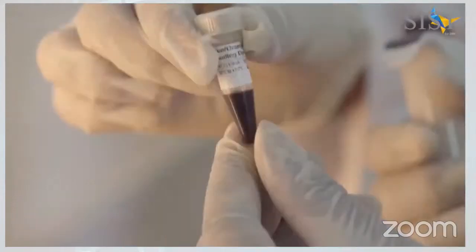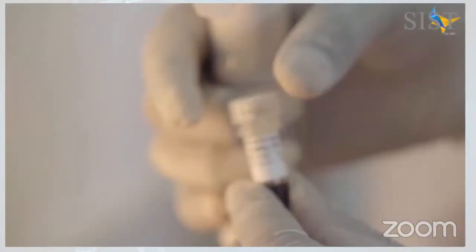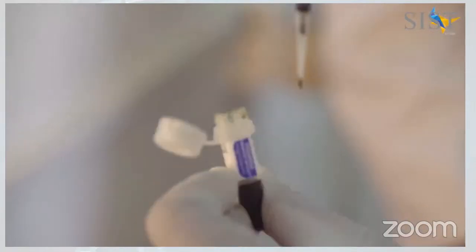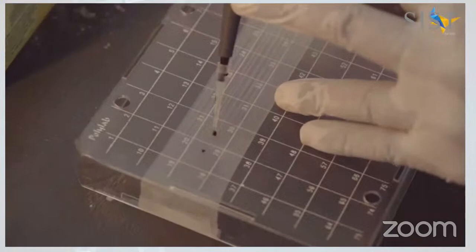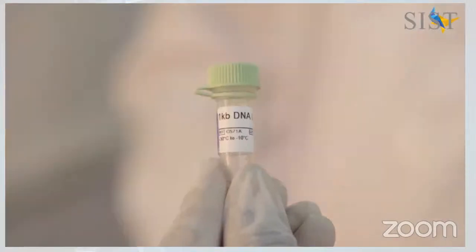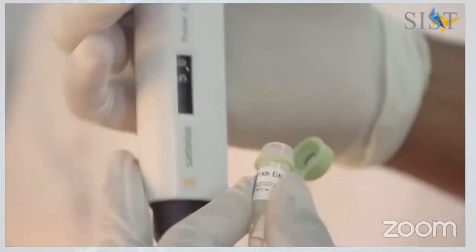buffer solution. When loading, you will need to add your loading dye before you add your sample. So here you take the required volume of loading dye, which contains the loading buffer, which will allow the DNA to settle inside the well by adding density, and the tracking dye, which will allow the visualization of the migration of your DNA during the gel run. You also can add a DNA ladder, which is a predefined ladder containing fragments of different base pair sizes. Here we are using a 1 KB DNA ladder that will separate into fragments with specific base pair sizes of DNA.